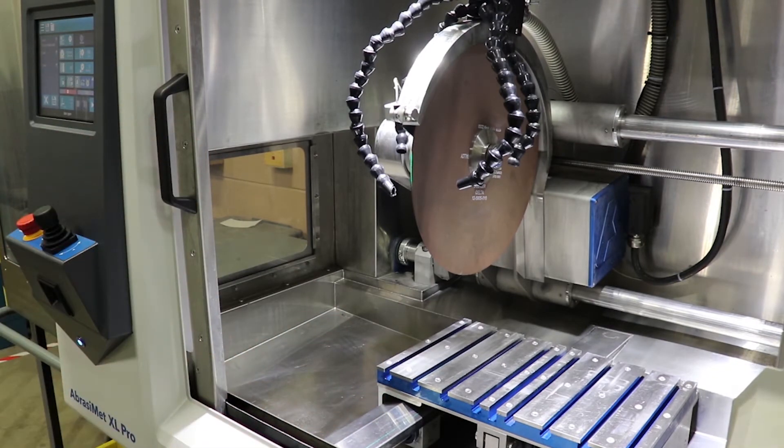The nut will self-tighten during cutting. Very easy, very fast blade changes — a heavy-duty robust cutter for your most challenging cutting applications.